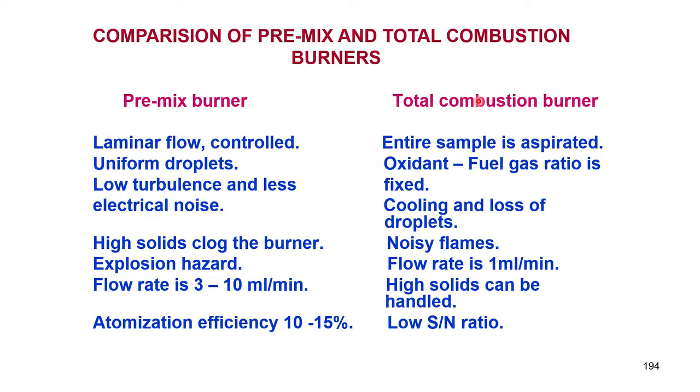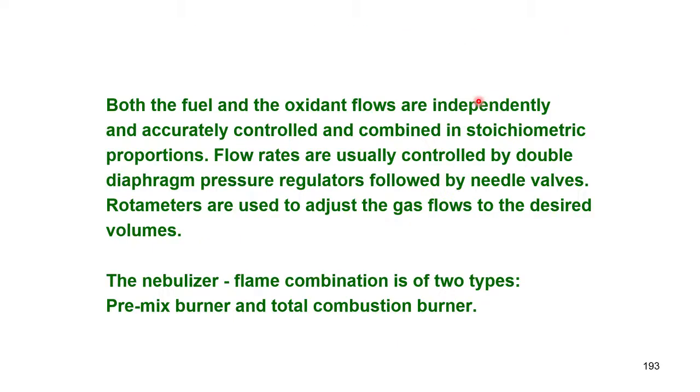So, what is a premix burner? A premix burner is one in which the fuel and the air flow rates are predetermined, that is a premix burner.